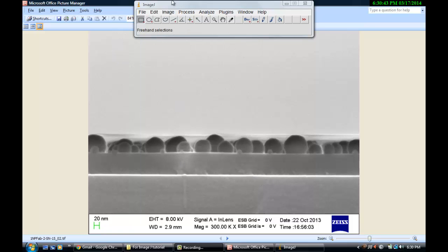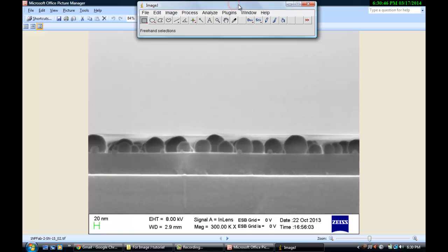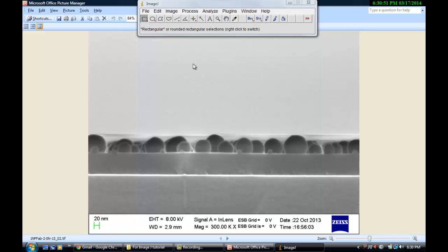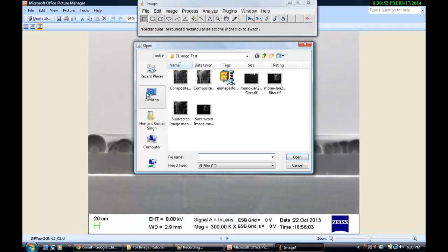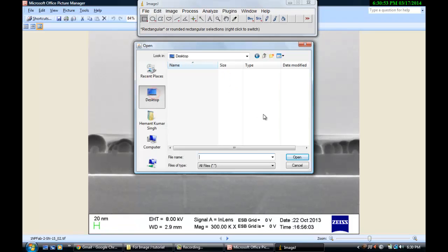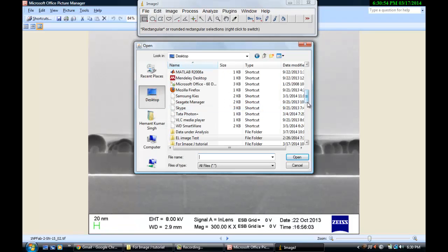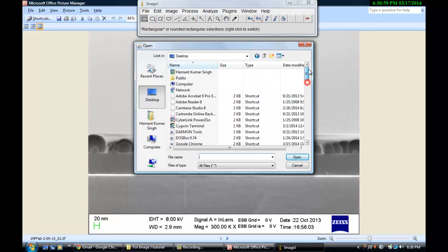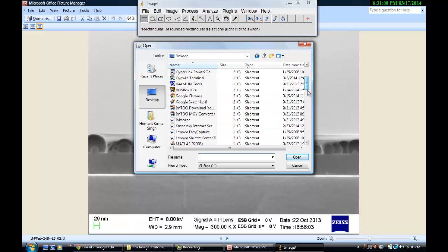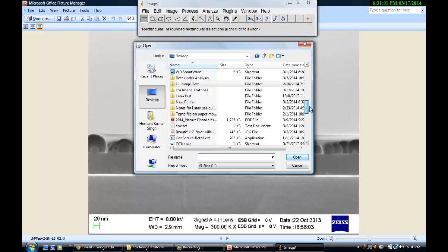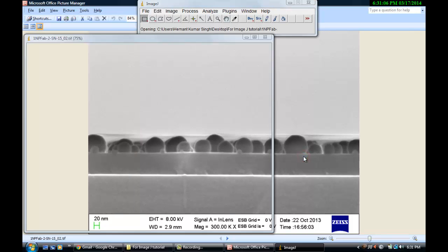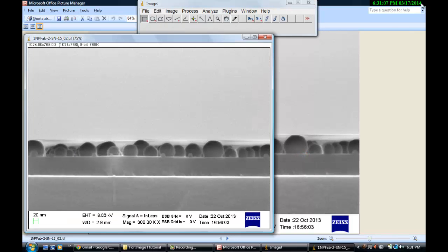So first of all, what you do is open the ImageJ software. It will look like this and you go to File, Open Image. Now it will select you the image where it is saved. In this case, I have saved this on the desktop in a folder called ImageJ Tutorial. Here, EMT sample. So this will open this sample.